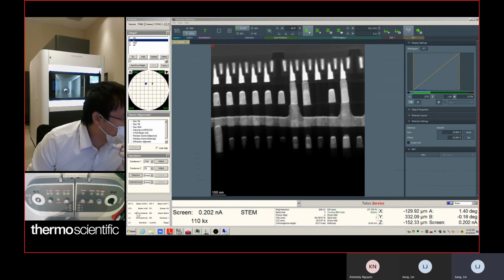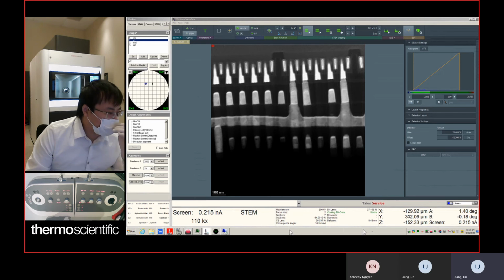Also from the right panel here. Sorry, let me make it right. Because we already have a spot size, you can just drop it out of the window to remove it. You can quickly drag the spot size and jump out of the window. You can move it anywhere you want to place this sample window.